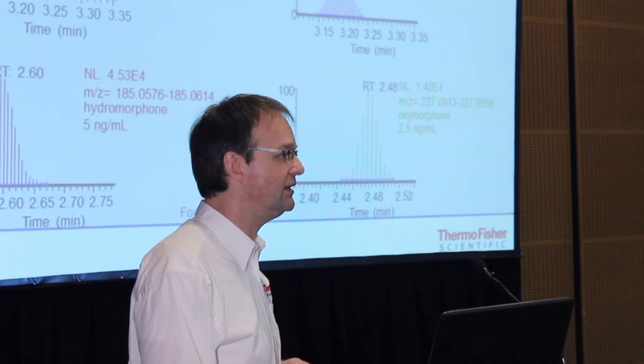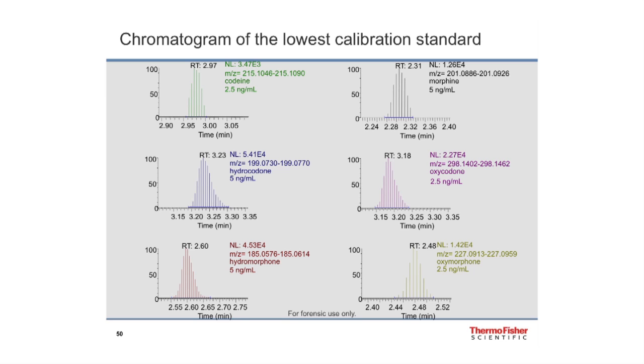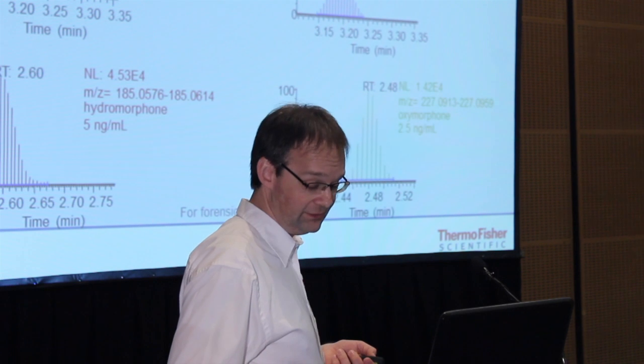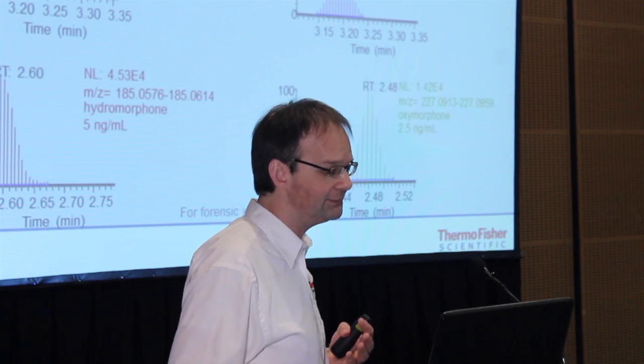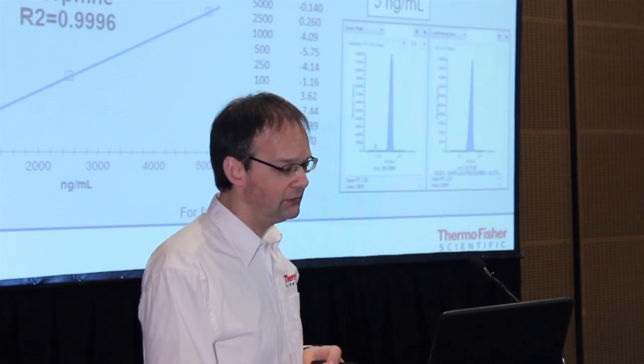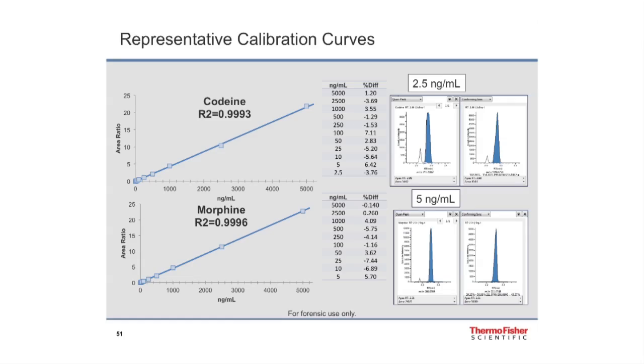Again, let's look into the scan speed of the instrument in that case. You see again, we get more than enough scans across the peak for quantitation, so no worries that you need to quantitate on a 3-peak representation. That's really enough that you get good peak shape and a reliable peak area. Of course, we want to see that the instrument behaves linear the same way, even in that matrix, but you see no problem here. It's perfectly linear.